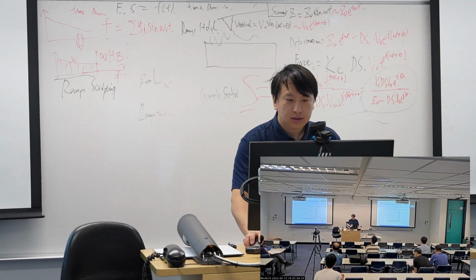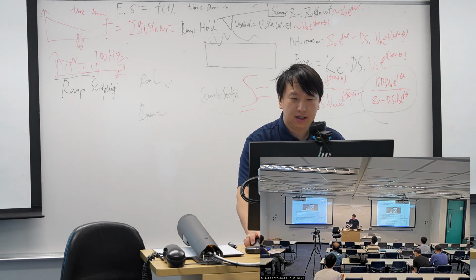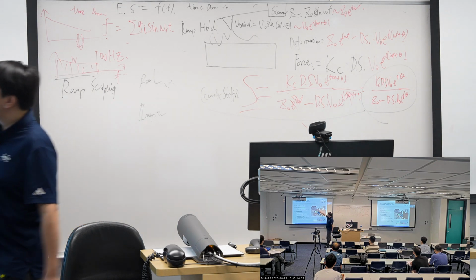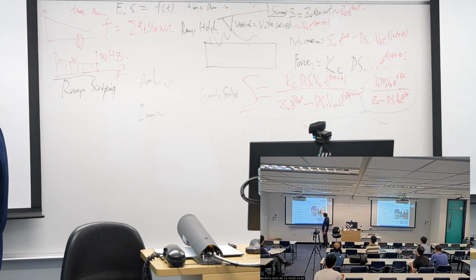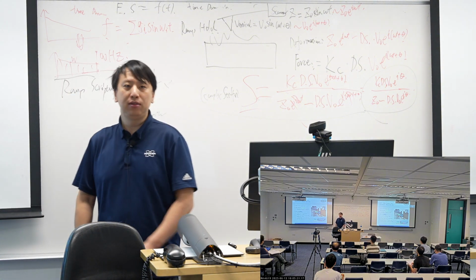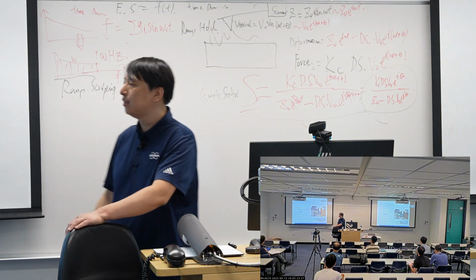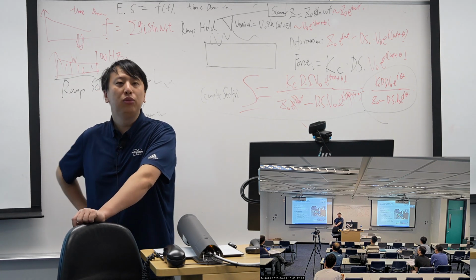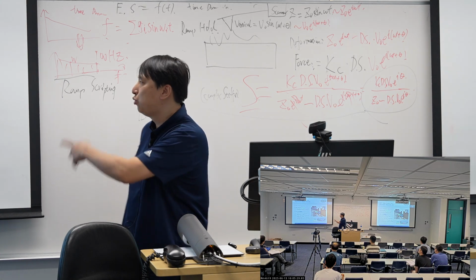Okay, so let's go back to the hardware. And the hardware is something like this. We have the blue one, which is marked as a heater. It's used to change the temperatures, like the macro scale DMA does.